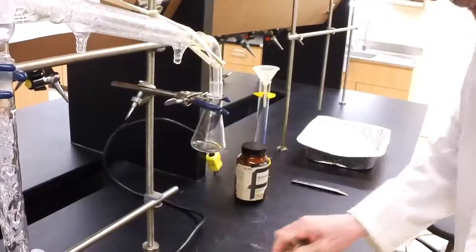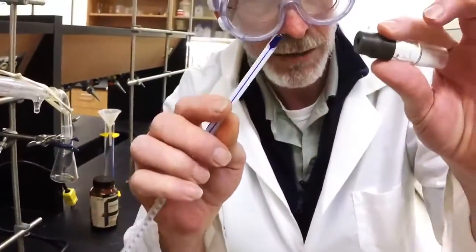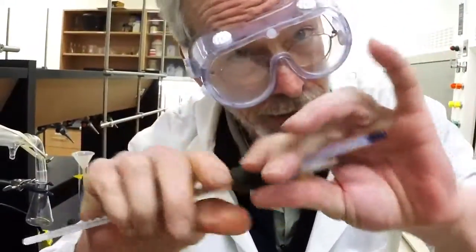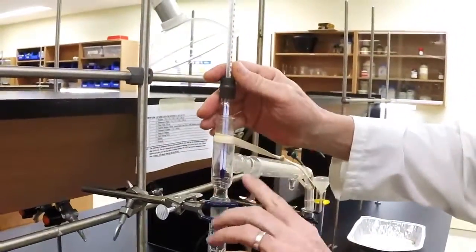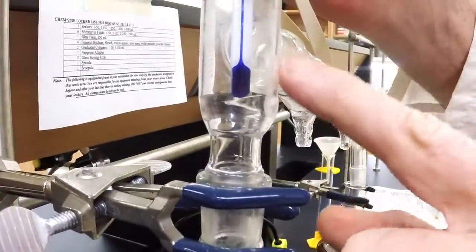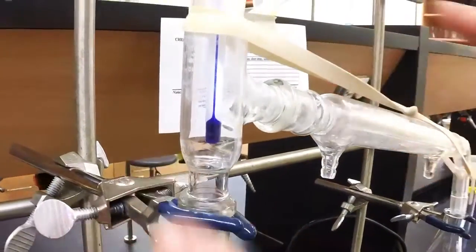We all need a thermometer. Be very, very careful when you put this thermometer in here — keep your fingers close together so you don't break the thermometer. Then position it, and the bulb must be below the exit point for the distillation. That way we'll get the proper temperature.